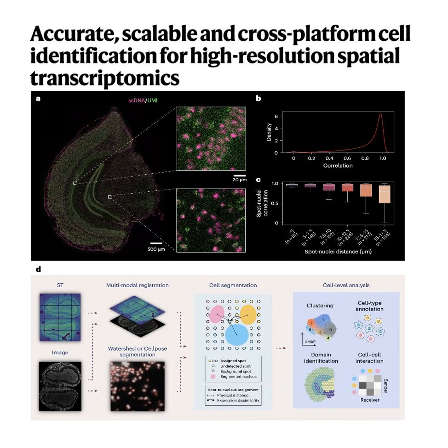Wow. Wait, so we have these ultra-high-definition biological cameras, essentially, but the algorithms tasked with drawing the borders around the cells are basically using a blunt crayon. That's a great way to put it. The paper mentions that legacy imaging tools, things like Baysor or SPARKLE, use what's called Gaussian priors. Which means what, exactly? It means the algorithm assumes the data naturally fits a standard bell curve. In physical 2D space, a Gaussian prior assumes every single cell is a neat, predictable ellipse. It forces a perfect circle or oval onto the data, even if the real cell looks like a splattered paint drop because of that diffusion. Exactly. The math just completely breaks down on irregular, messy barcoding data.